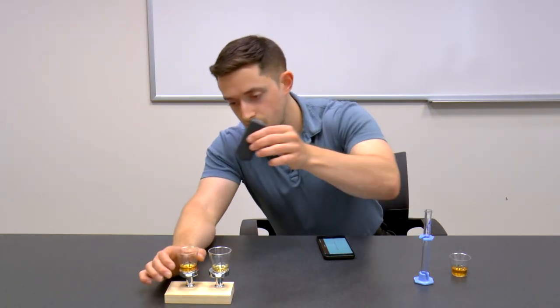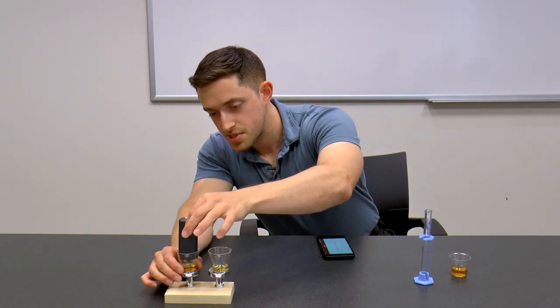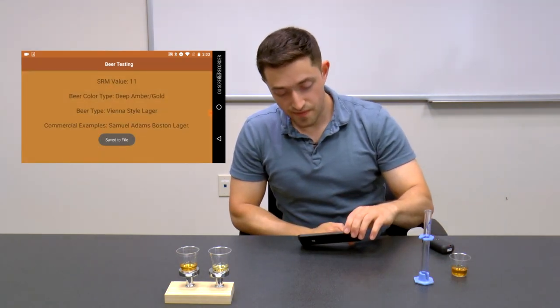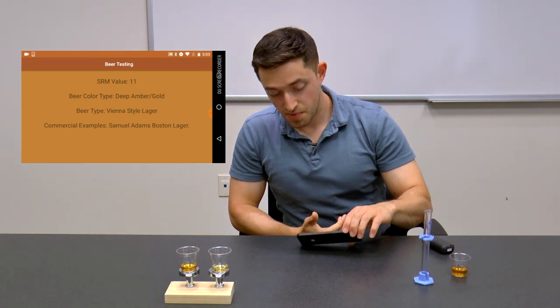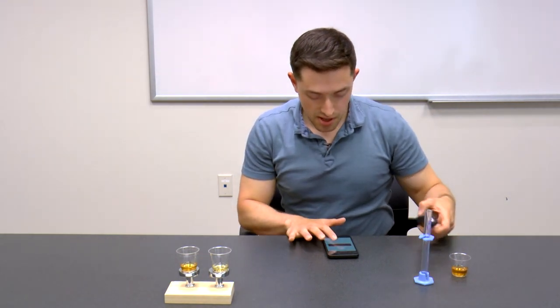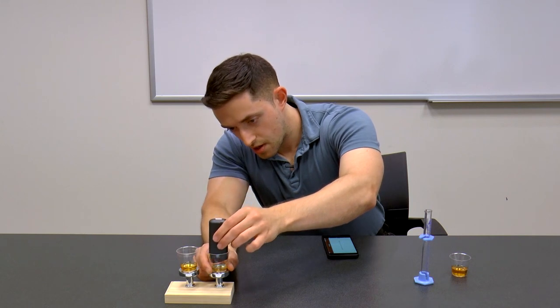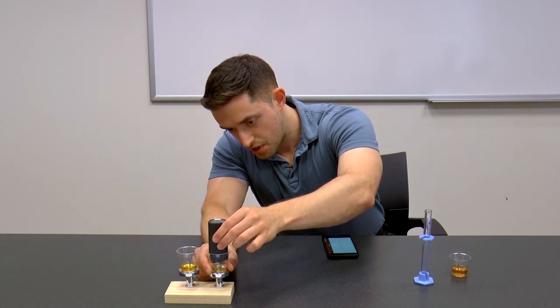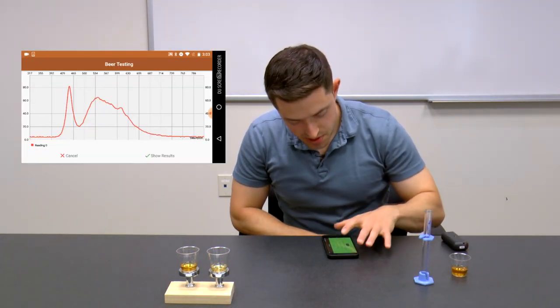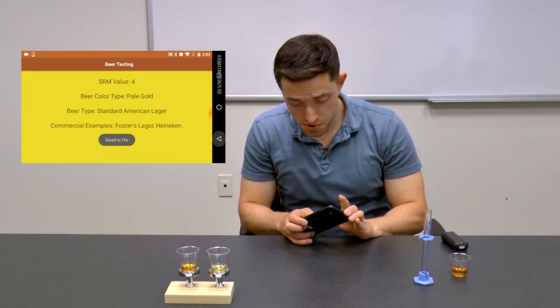I'll capture data on the first beer. Light shines, reflection happens, and I have the spectrum. Asking the app what it thinks — it says I have an SRM value of 11, and a commercial example would be Samuel Adams Boston Lager. Now let's take a look at the lighter beer. I put it in the module, shine the light, and get a spectrum. The app gives me an SRM of 4, and says a common example would be Heineken.